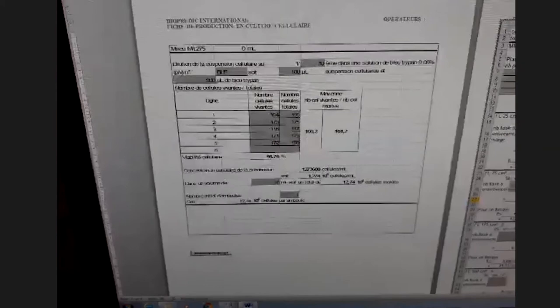After assessing cell viability, we are now ready to seed the cells.